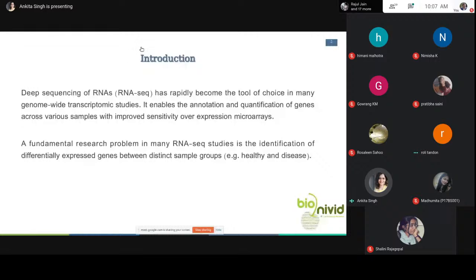So in this way, you will find a lot of applications wherein you will have the usage of this differential expression. Let us just focus more on RNA-seq because this will give you a good clarity, and then you can also apply this understanding into another application of NGS.